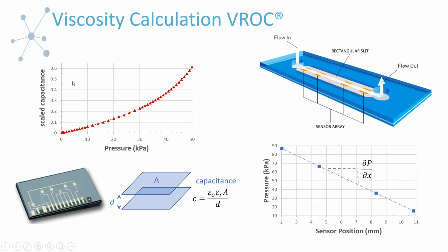When we calibrate, our instrumentation is calibrated in-house, so there's no calibration done on site. You would consistently check standard materials to make sure everything's performing okay, but you're not ever going to do a calibration yourself. So we're calibrating the capacitance, I guess, to the pressure in the cell. Then we use this capacitance to get our pressure drop across the flow channel. So this is the first step in the process for our instrumentation.